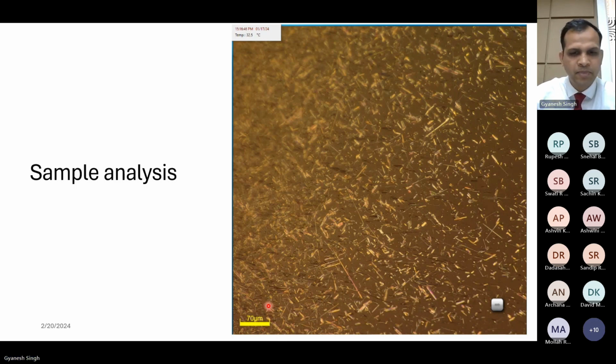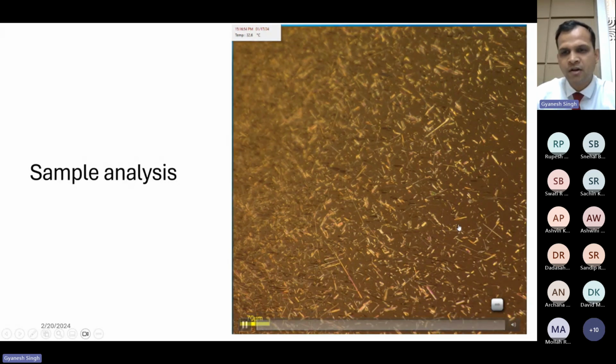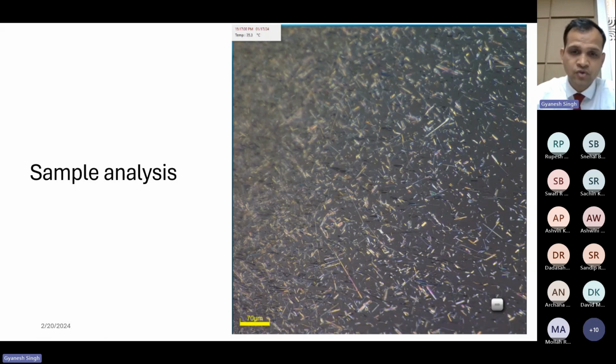Now, I'm going to play the video. Just watch this, and you can see some small movements here. Once I'm playing the video, there are very small transitions happening while the video is played, which may not be seen by us very easily. Here we have recorded the entire video of 40 minutes. So it has its own benefit to see those changes.